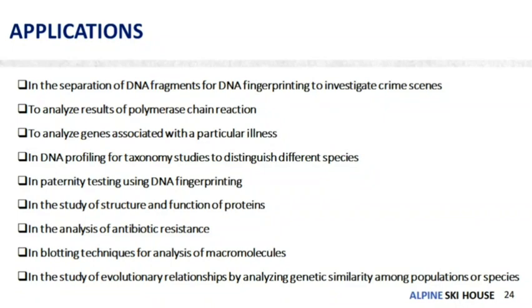to distinguish different species, in paternity testing using DNA fingerprinting, in the study of the structure and function of proteins, in the analysis of antibiotic resistance, in blotting techniques for analysis of macromolecules, in the study of evolutionary relationships by analyzing genetic similarity among populations or species.